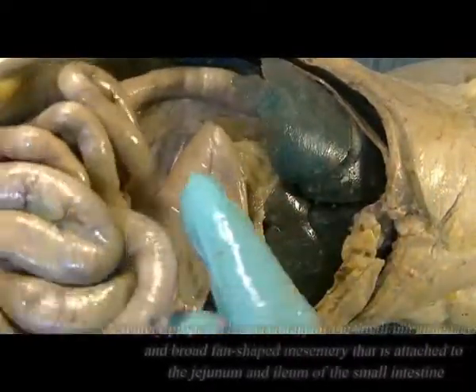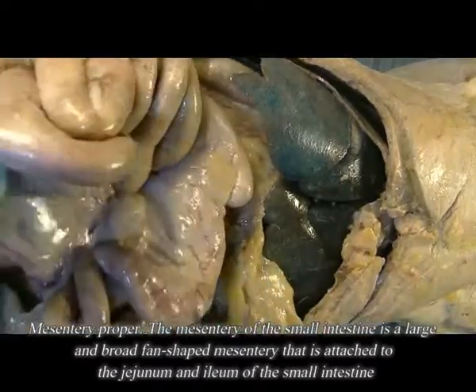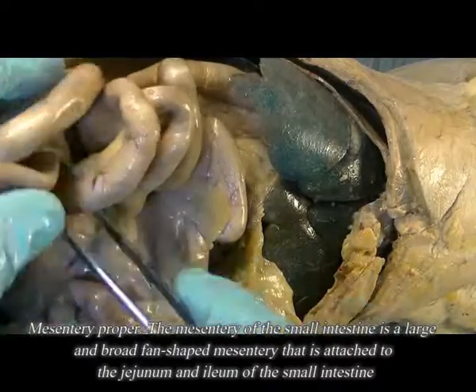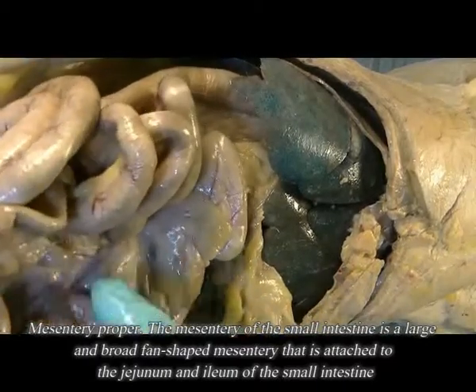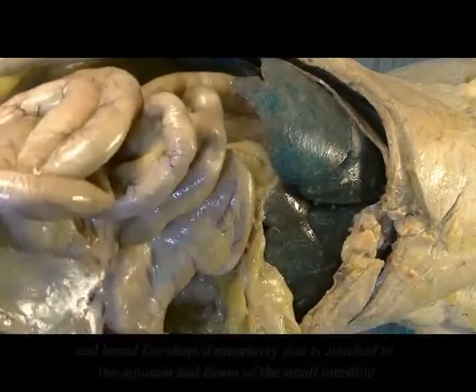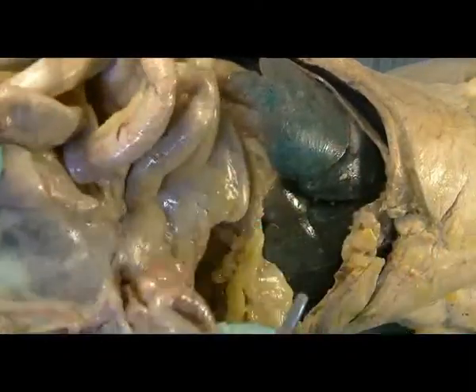Okay, and I rearranged things a little bit. You can see the duodenum, the jejunum, and the membrane which keeps it from tangling up. It's called the mesentery proper.